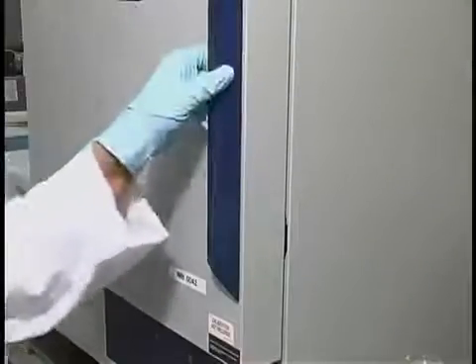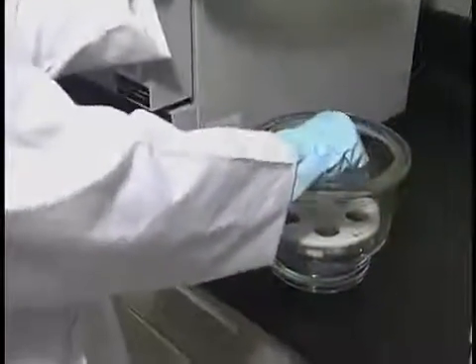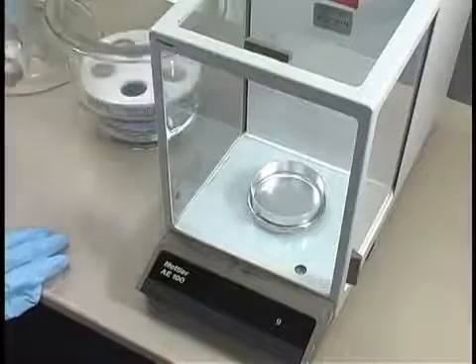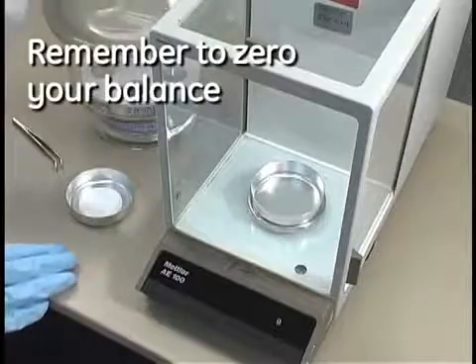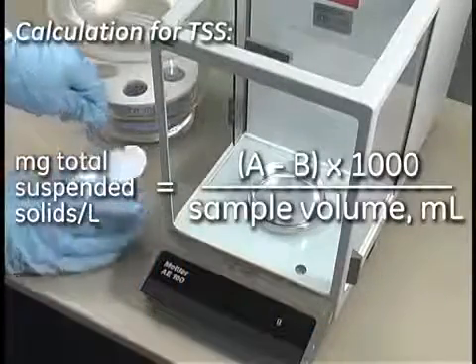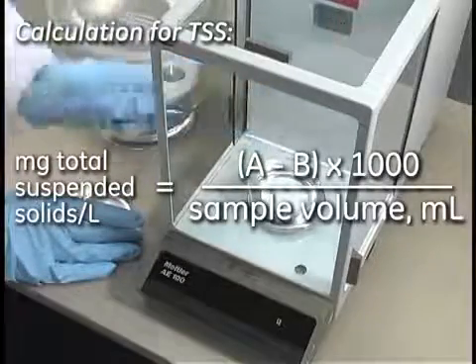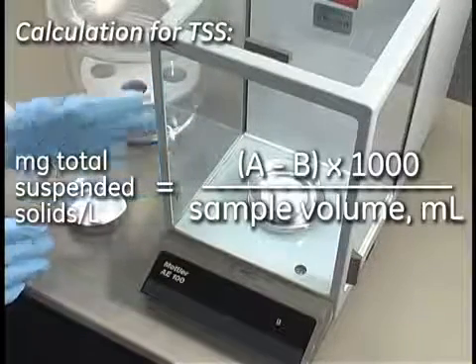Remove the filter from the oven and place it into a desiccator. After the sample has reached room temperature, remove from the desiccator and place in the balance. Record the weight. You will need to repeat the drying process until a constant weight is obtained.